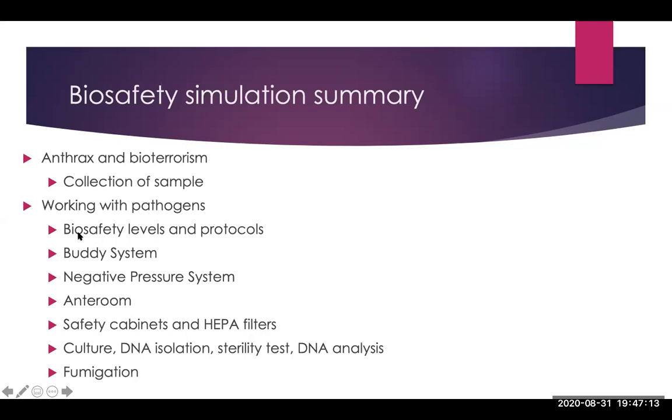So you're going to learn about biosafety levels, the different types of labs and the protocols involved with those labs, to make sure you're safe, and also the integrity of your sample and your work. They're going to talk about the buddy system, which is one of the protocols for biosafety level 3, which is what the simulation is.